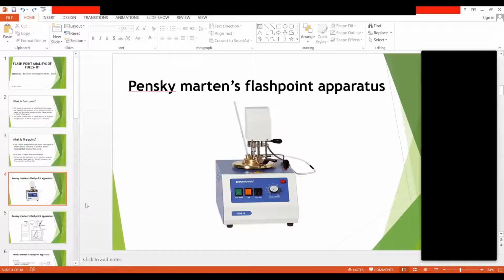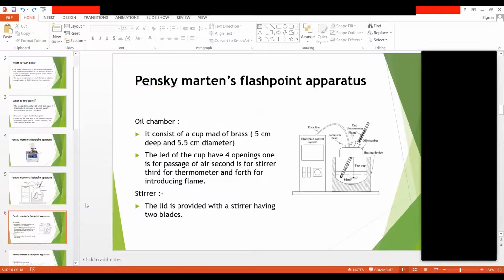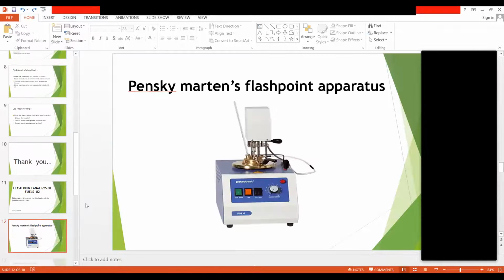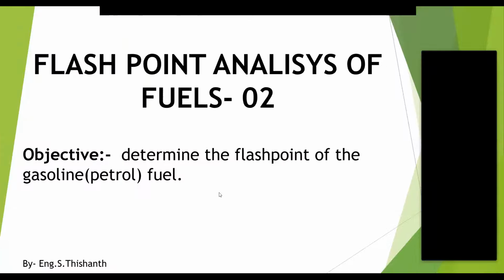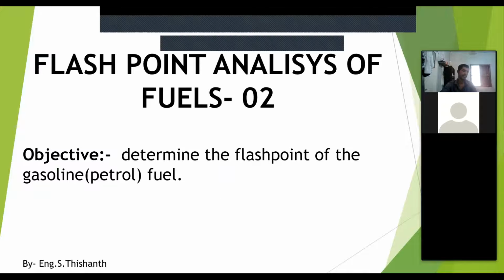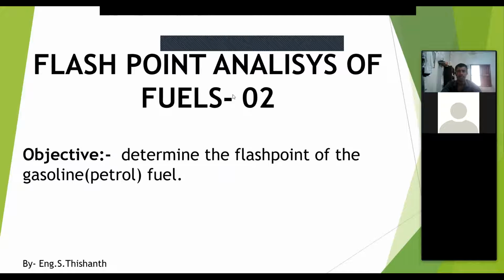And this Pensky-Martens apparatus we are again going to use for the petrol fuel, right? So this is flash analysis of fuels number 2. We definitely have 2 sessions, because if we are going to demonstrate this practical it takes a lot of time. So I decided to divide it into 2. Today's session is about gasoline.